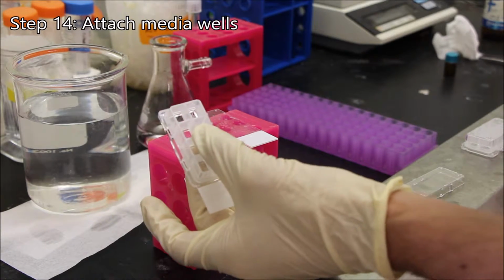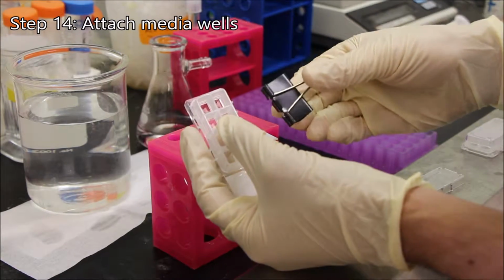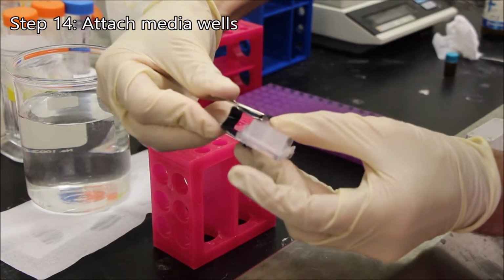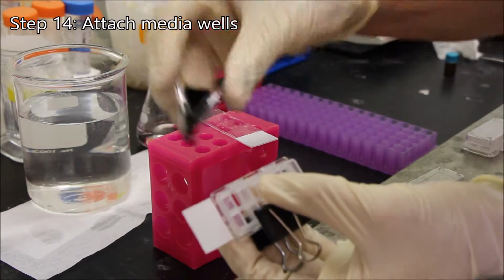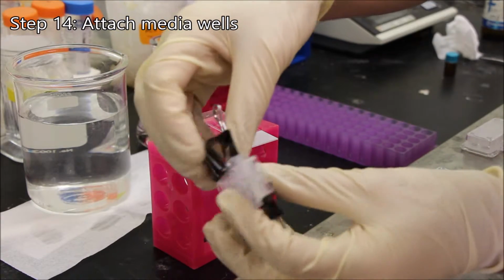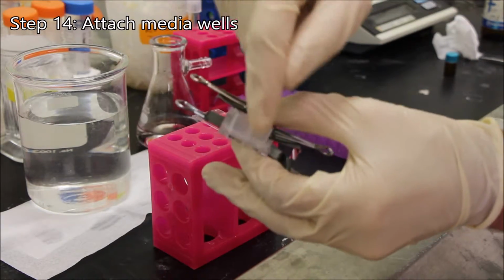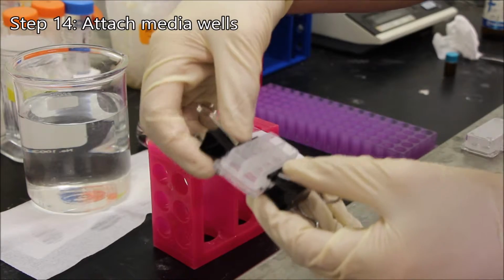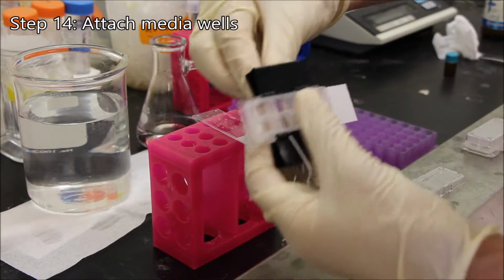And now, while holding it like this, I'm going to take 2 of these clips. They're medium binder clips. And so the first one I'm going to open up. Let me hold it this way for you. I'm going to open up, clip it over the top, and then carefully rotate it around. And the second one, there's the 2 old clasp spots, and that's going to fit right on there. And then the one that's open all the way, while clamping tightly with my fingers, I'm going to move this down. I'll just gently tweak this to test it, but now you can see it's held on both sides there, and I can remove the metal portion of the binder clip.